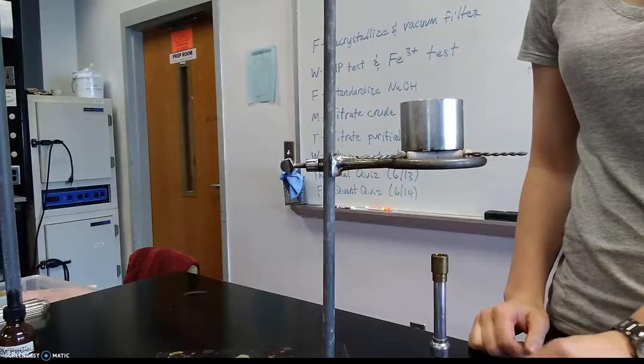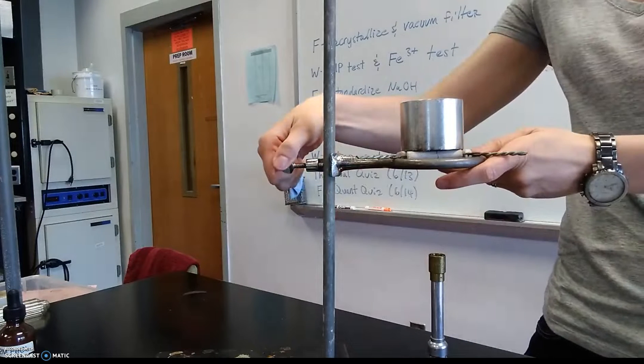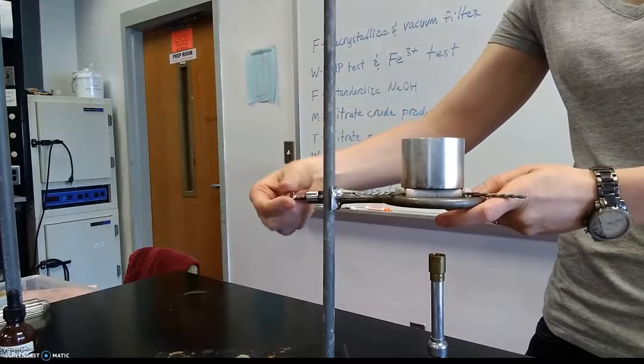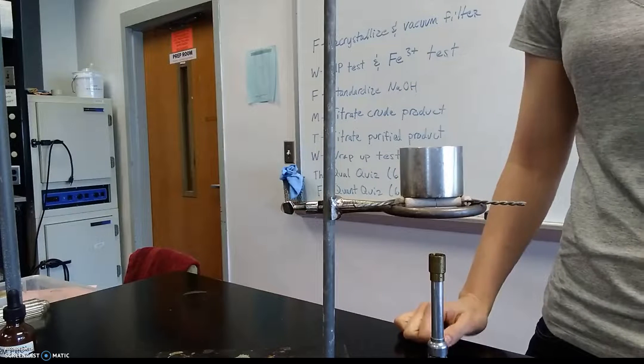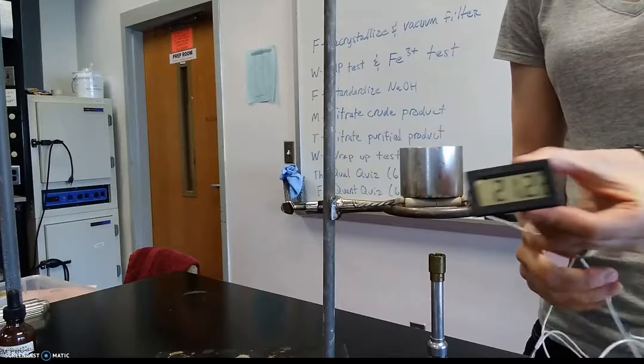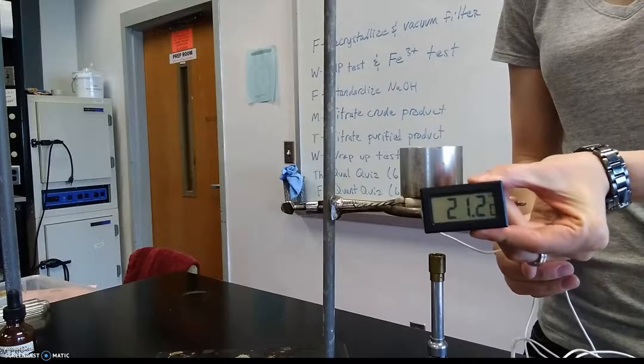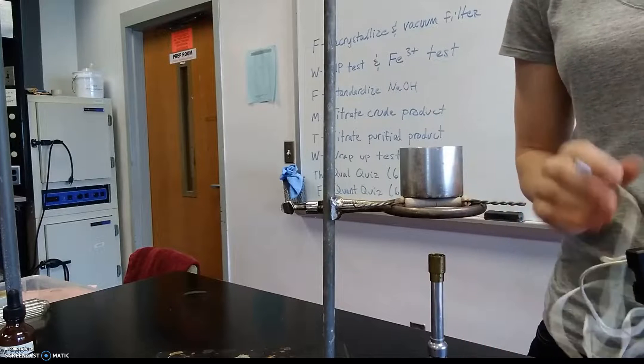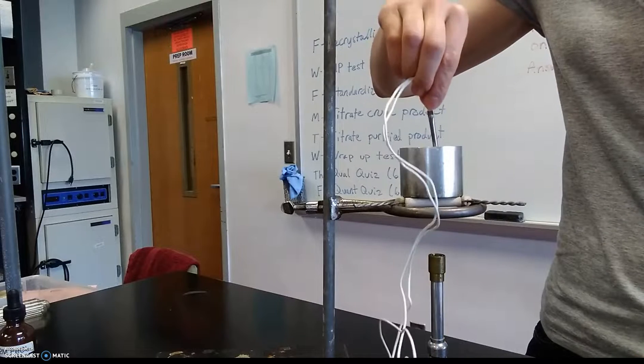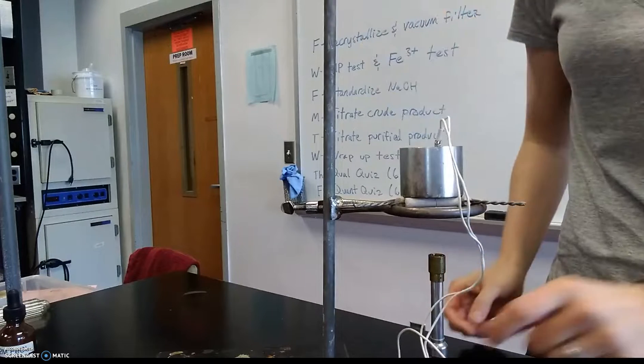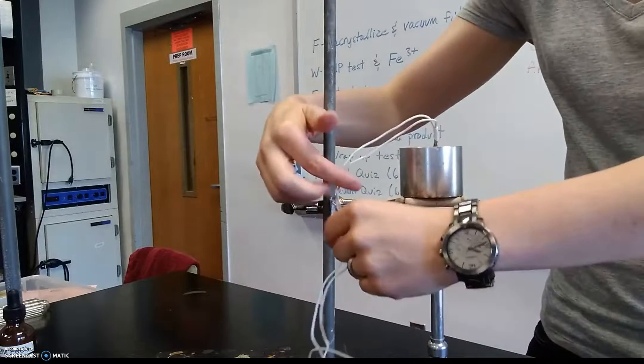We're going to be using a Bunsen burner to heat it. So this aluminum block is going to get really hot. You don't want a ton of space between your setup and the Bunsen burner flame so bring it down. Definitely don't do this after you start to heat it, you're going to burn yourself. And finally we're going to be using a digital thermometer to make life a little bit easier for you. It's got that long cord and then like a metal coated probe. Put the probe in the little hole.